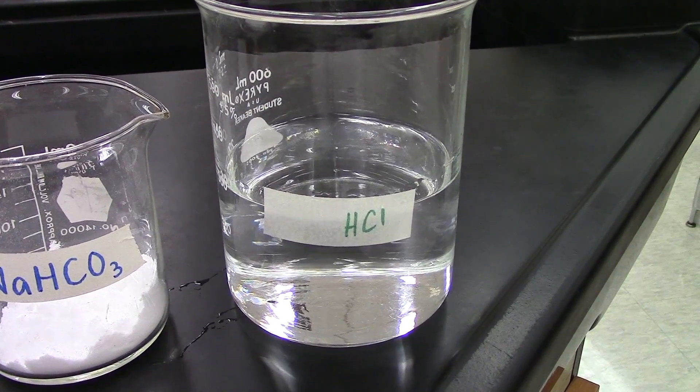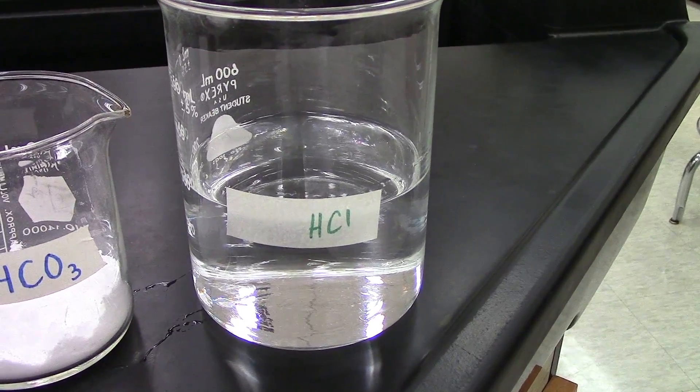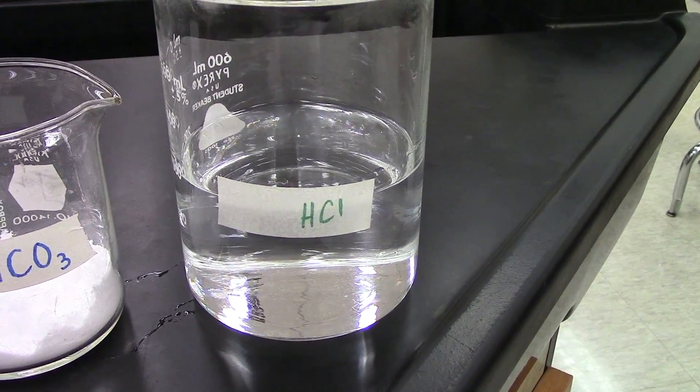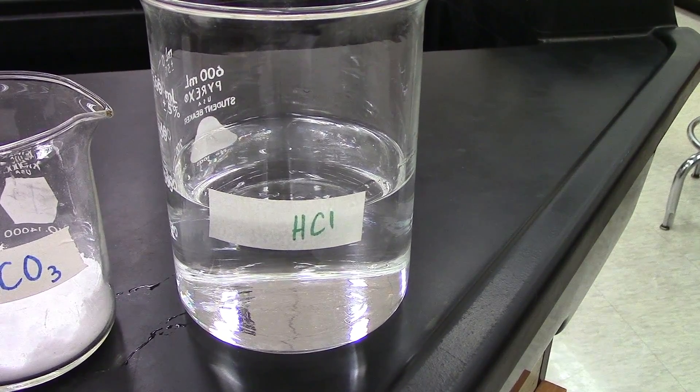We could use vinegar to do this as well, but to be frank, if we use vinegar it stinks up my classroom. So we'll use hydrochloric acid. It works pretty well and it has no negative smells associated with it.